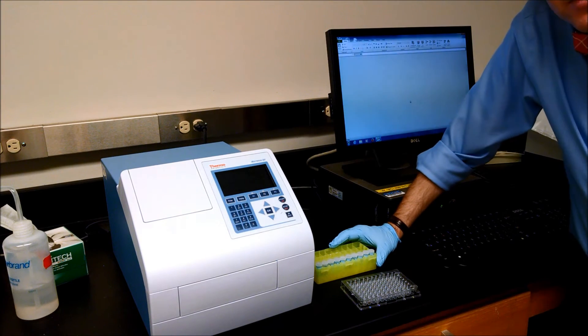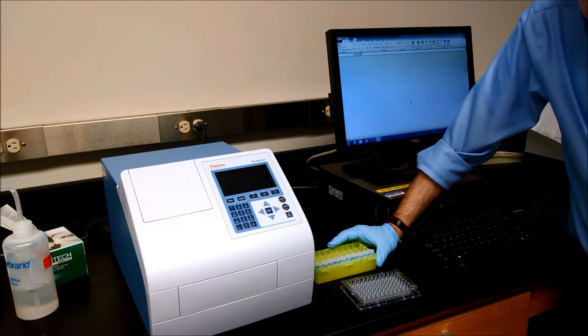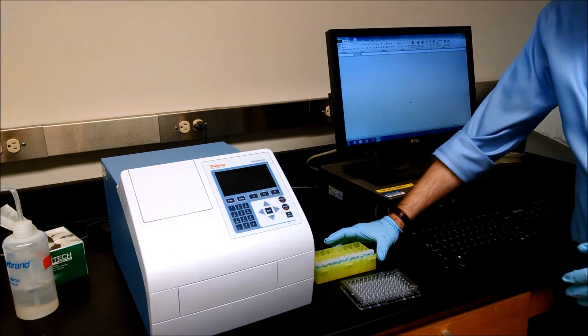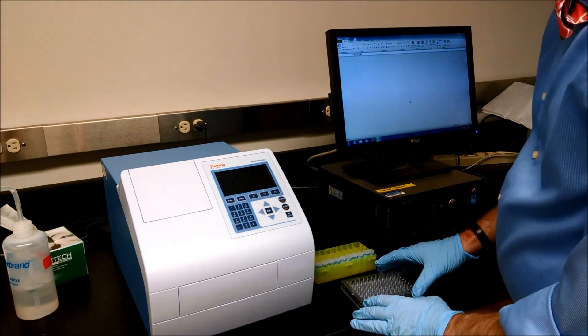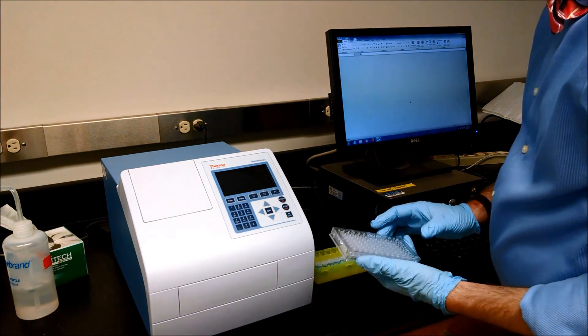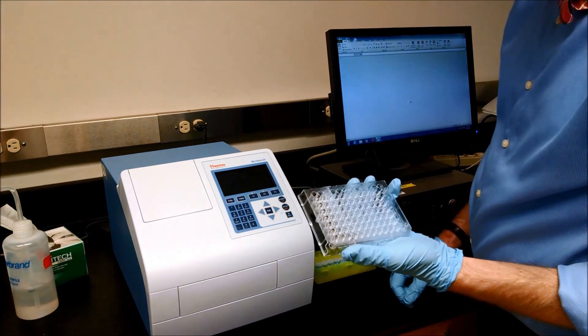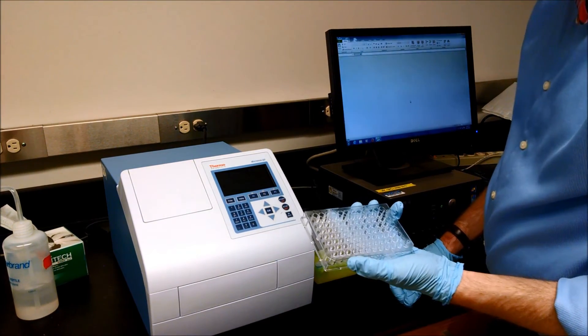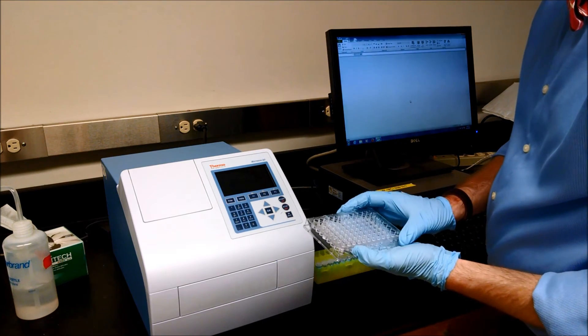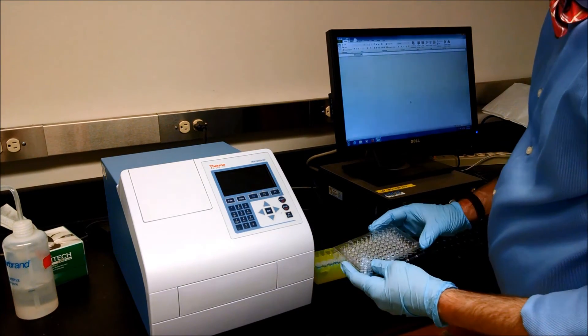For measuring the absorption spectrum of our quantum dots, we're going to use the multi-scan. In this case, we're going to use the clear colorless plastic 96-well plate.